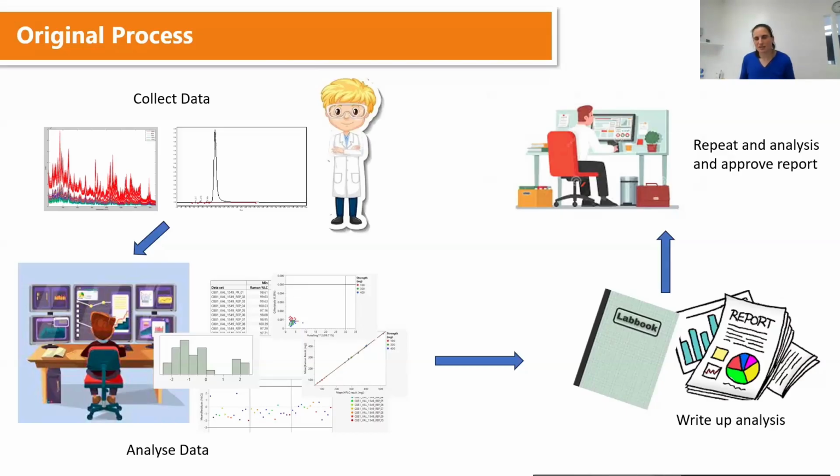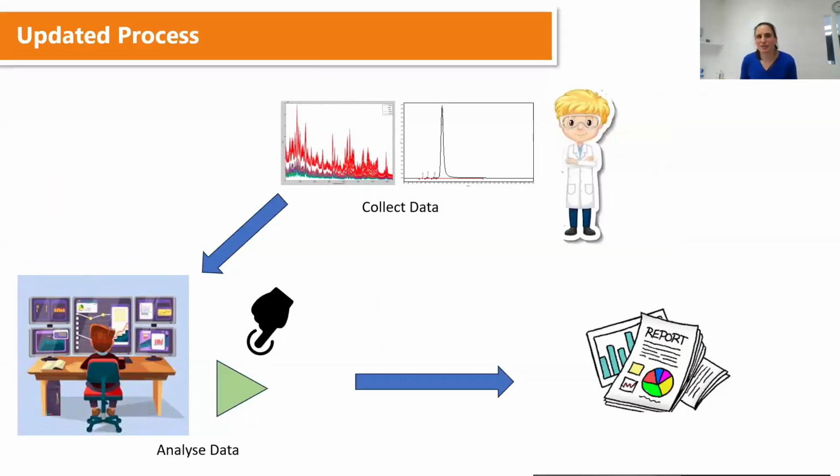Now, as you can imagine, this is quite a slow process, and we're often being asked to get things done so we can release drugs out of the manufacturing. And it's quite repetitive each year. So what we wanted to do is this updated process. We still have to collect the data, that can't change, but rather than doing the same steps over and over again manually, what I wanted was a way to get the data, press one button, and then generate all the results that I wanted.